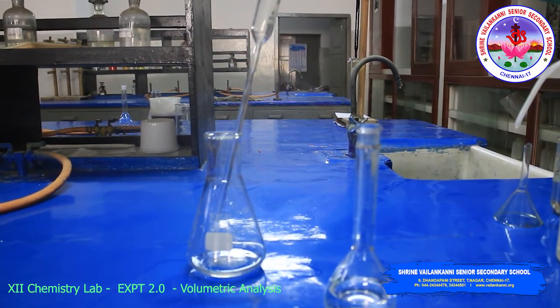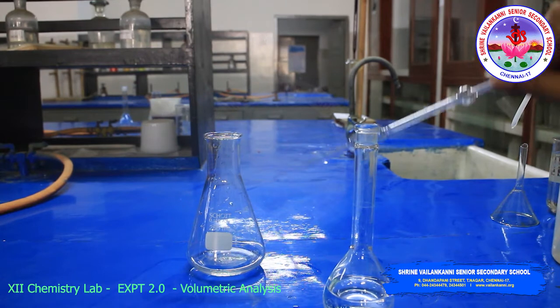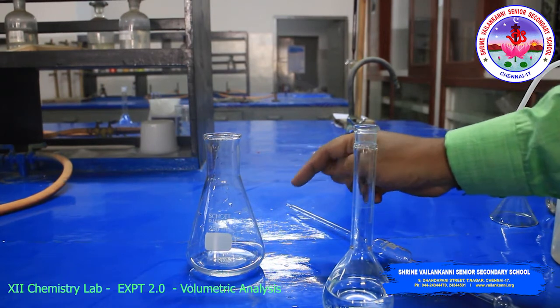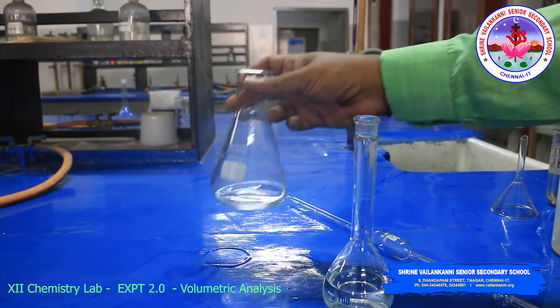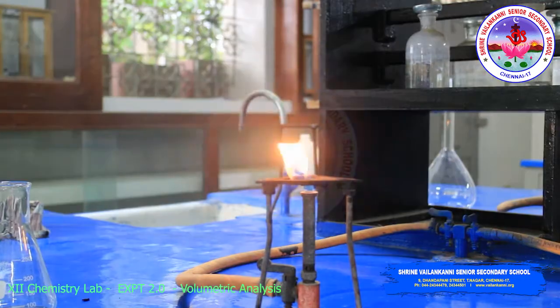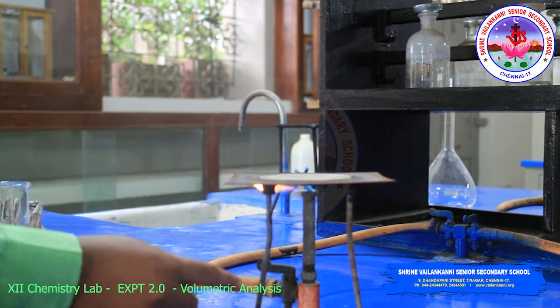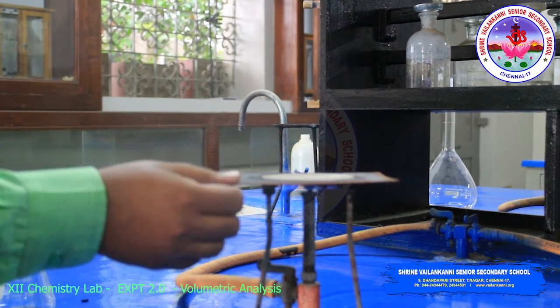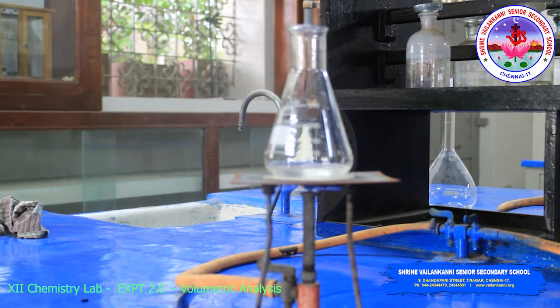After transferring the solution, you have to heat the conical flask solution, because this contains carbon dioxide, because COOH group is there, so that we have to remove the carbon dioxide gas. So we have to heat the solution. See, I am going to heat the solution. This is tripod stand and this is wire gauze. You can't heat directly, so using of wire gauze is very important.